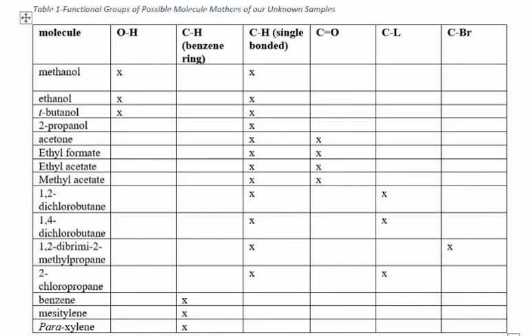The NMR spectra for the unknown substance 19.2 shows 2 peaks with a ratio of 1:3. Of this combo, only one molecule has a carbon to bromine bond, 1,2-dibromo-2-methylpropane. Now that we have successfully determined what our unknowns are made up of, we can find out if these molecules will kill a man.